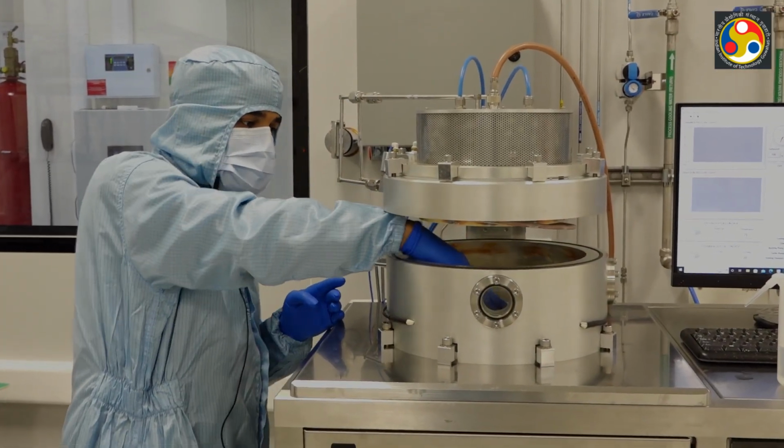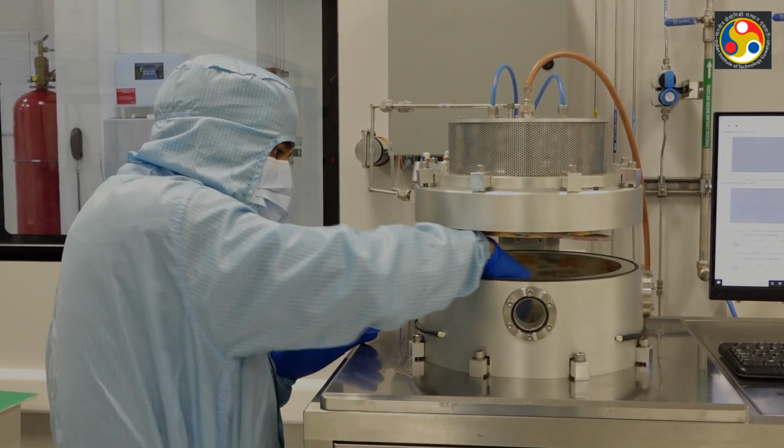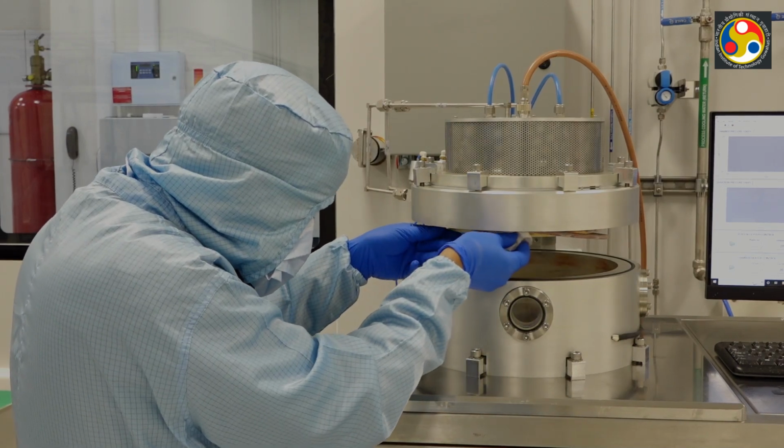So you need to gently wipe the platen, the inside chamber walls and these rings.